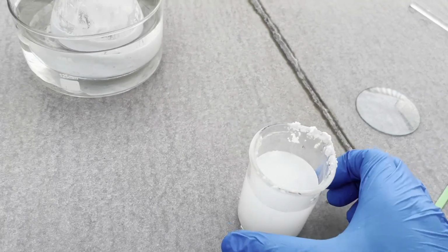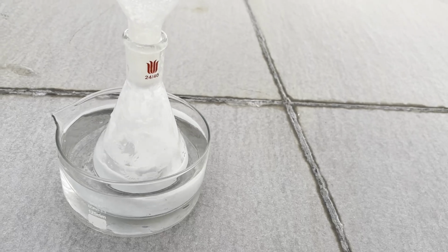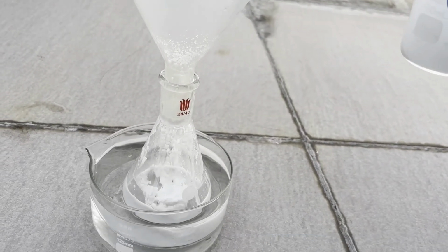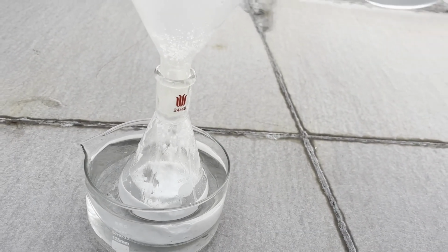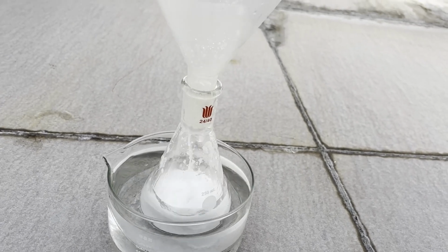You may imagine it would be easier to dissolve the potassium hydroxide into ethanol first and then add hydrazine sulfate, but the precipitated potassium sulfate is gel-like and traps a lot of hydrazine. Mixing the two solids directly can avoid this loss of yield.